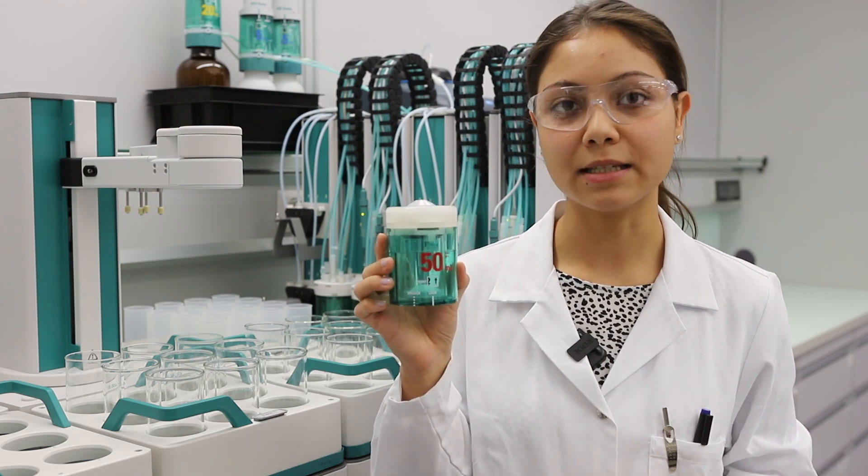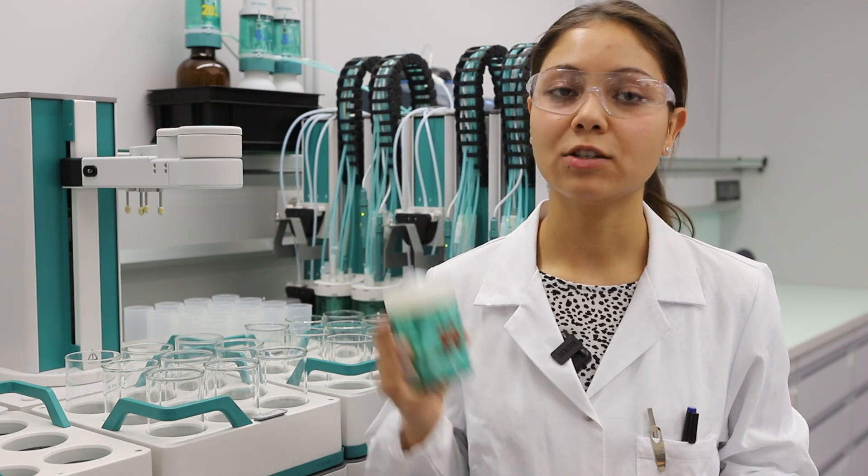Thanks to the automated sample transfer using an Omnis cylinder unit, you can easily just add your sample into the beaker, place it on the rack, and your system will automatically dose the required volume for your determination.